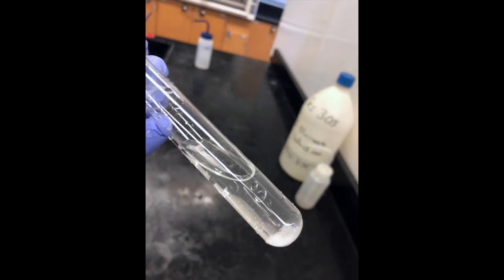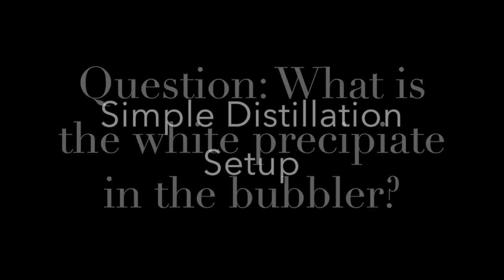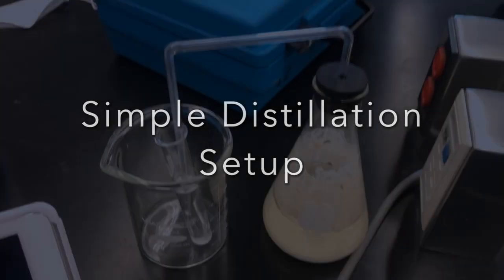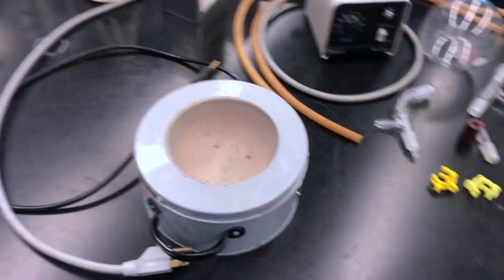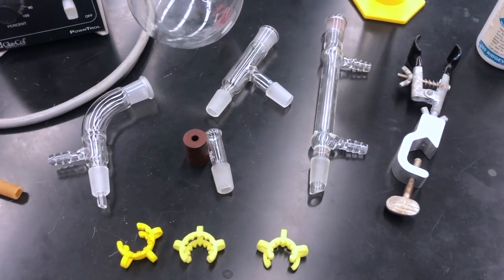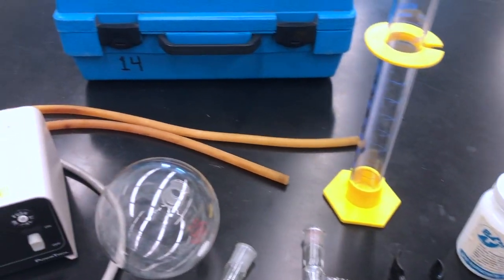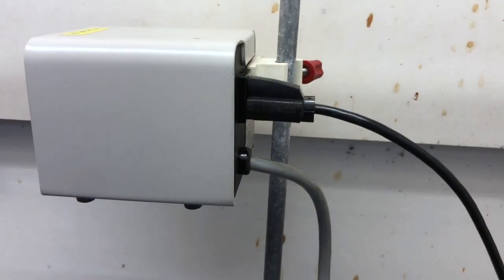We also see a precipitate inside the calcium hydroxide bubbler tube. At this point we are ready to set up our simple distillation. We have our fermentation, we have a ceramic heater, some water tubes, a heating regulator device, as well as each individual piece of glassware including a 500 milliliter round bottom, a condenser, a distillation head, a thermometer adapter, and a vacuum adapter with the associated clips.